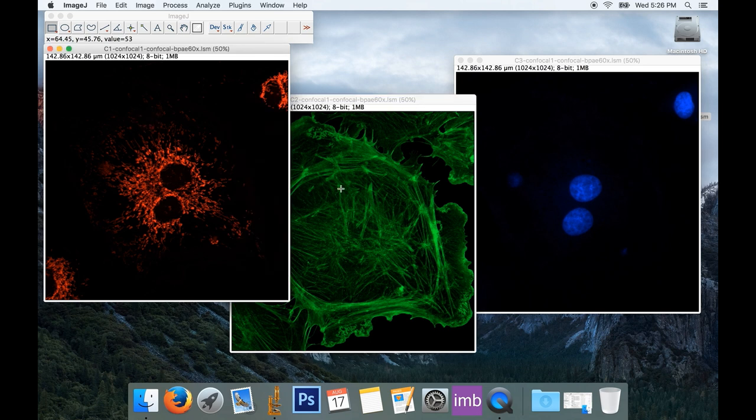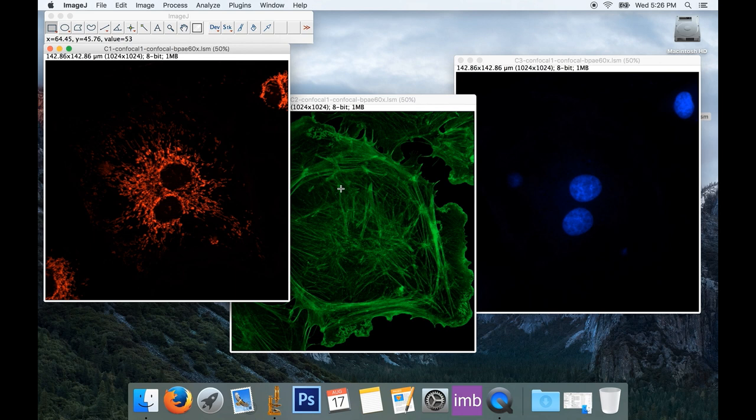Now right now they're displayed in color, and this is what's called indexed color. And what I'd really like is to have three grayscale images so I can use those grayscale or black and white images to build my figure for my publication.